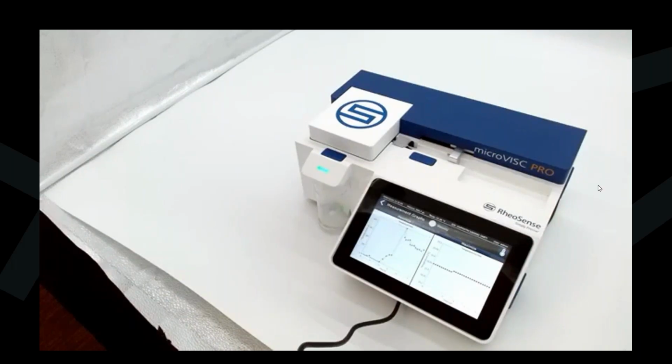It's pushing the sample until the sample is introduced into the channel, and then it pushes a bit more to gauge the sample. It's gauging it to determine what shear rate it's going to select for this sample. That's how this automatic measurement mode works. It selects the shear rate for you based on the sample that you entered.